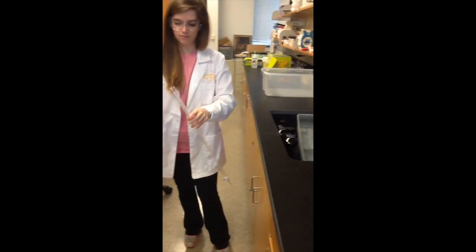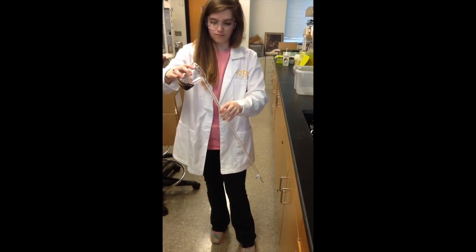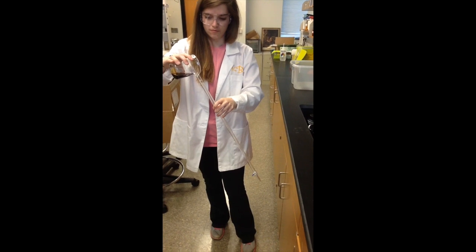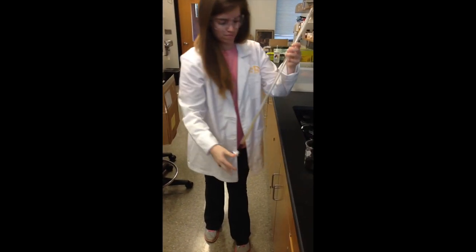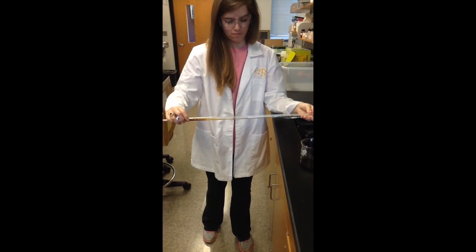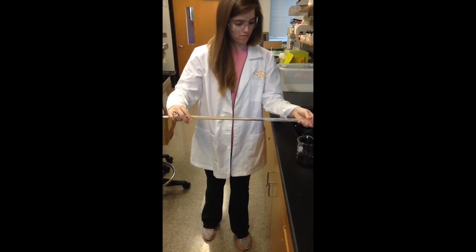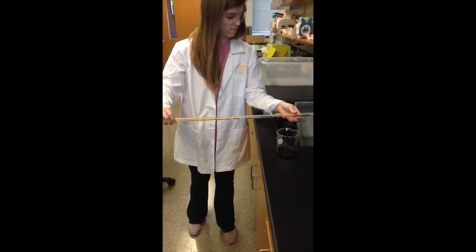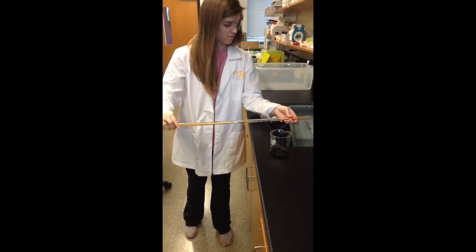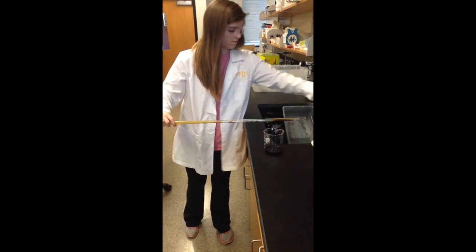First, prepare your burette by pouring about 5 mL of iodine into it. Make sure the stopcock is closed before you do this. Over the sink, tilt your burette so that the iodine solution will coat most of the inside. Discard the iodine in the sink and rinse with plenty of water. Repeat this process one more time.